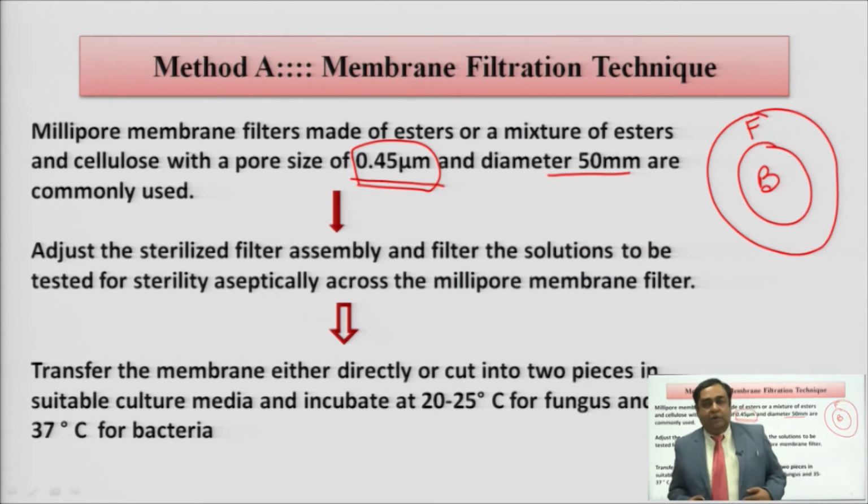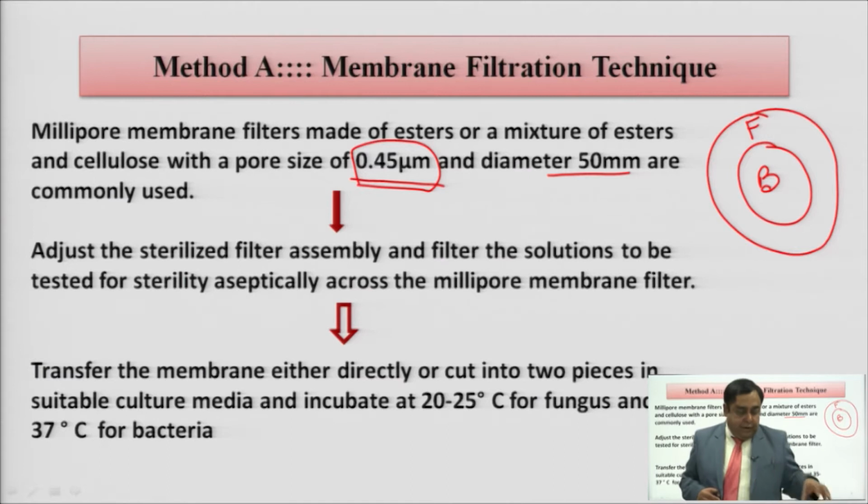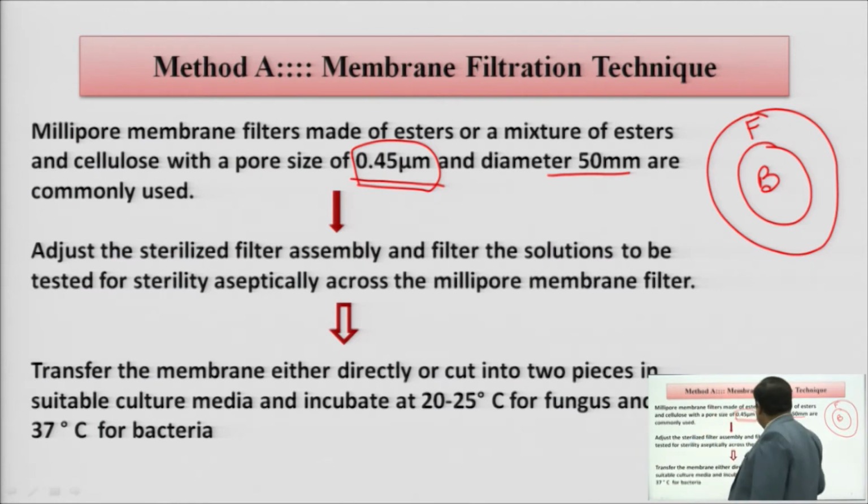But the best way of doing this is you prepare in three sets. Set number 1 you put in an aerobic media, set number 2 in an anaerobic media, and the third one in a fungal media.